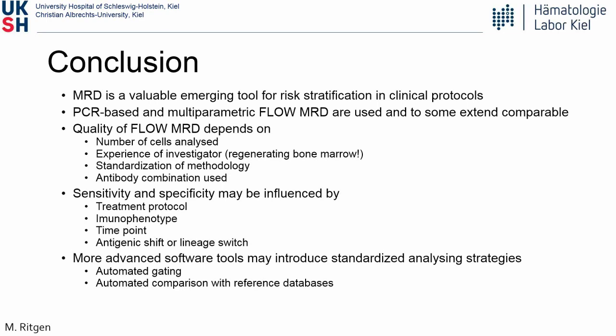Yeah, so this also answers another question which we had, about any advice on the use of CD73, CD123, CD304, and CD66c. Yeah. So I think this answers that perfectly. Thank you.